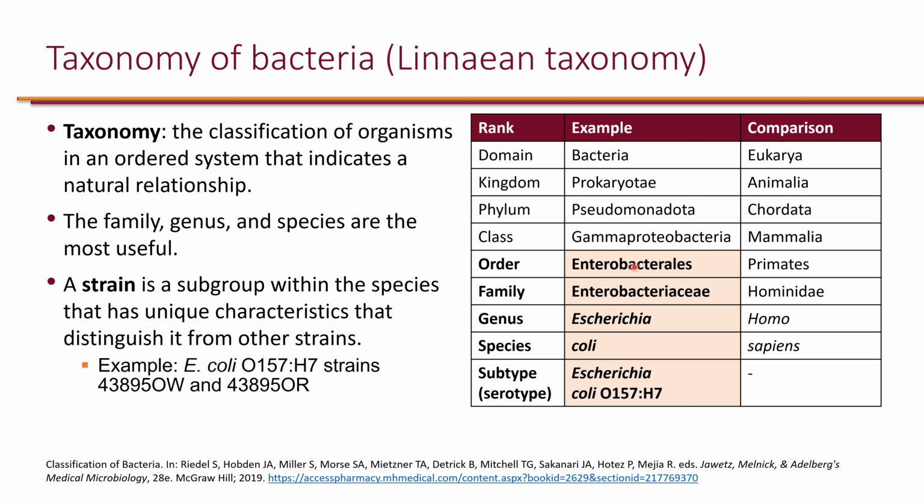the order Enterobacterales. Now, a strain is a subgroup within the species that has unique characteristics that distinguishes it from other strains. For example, E. coli is the species, and E.